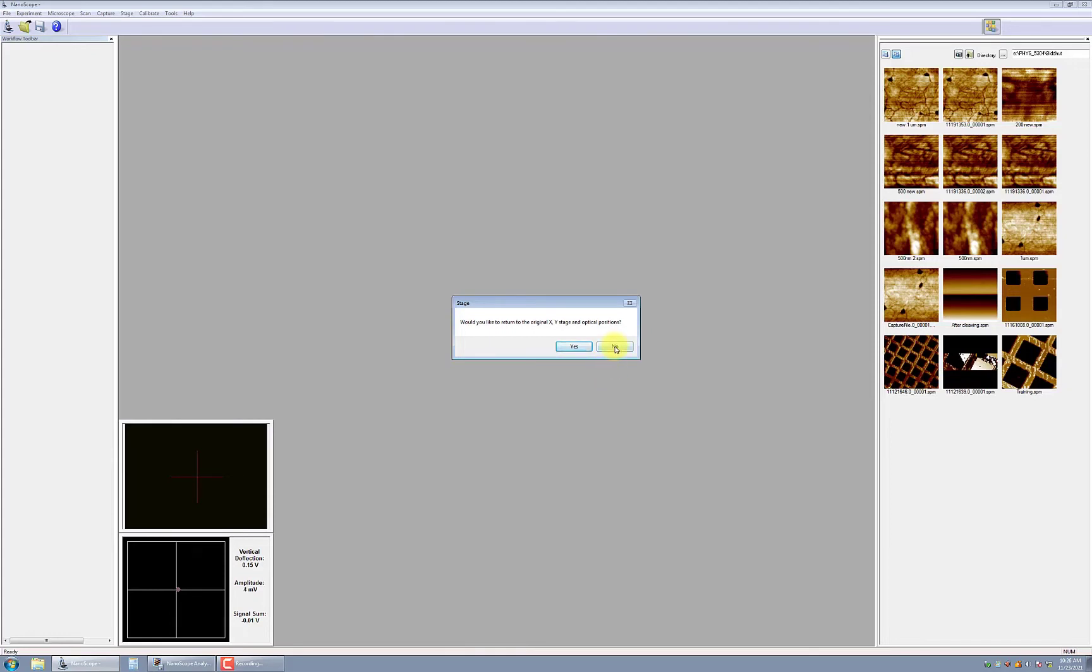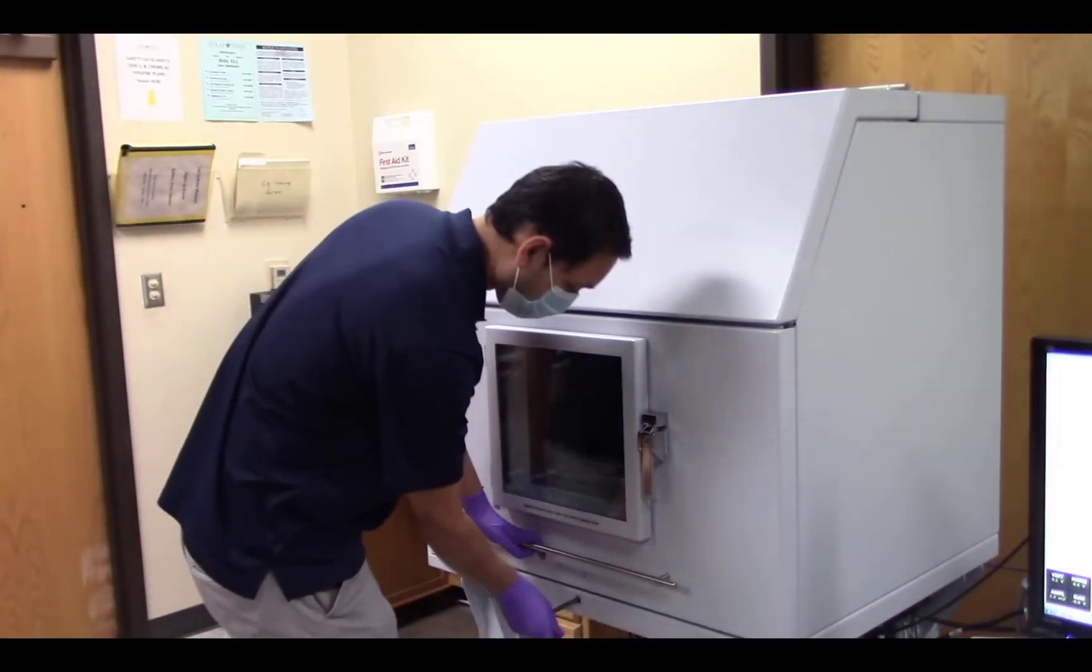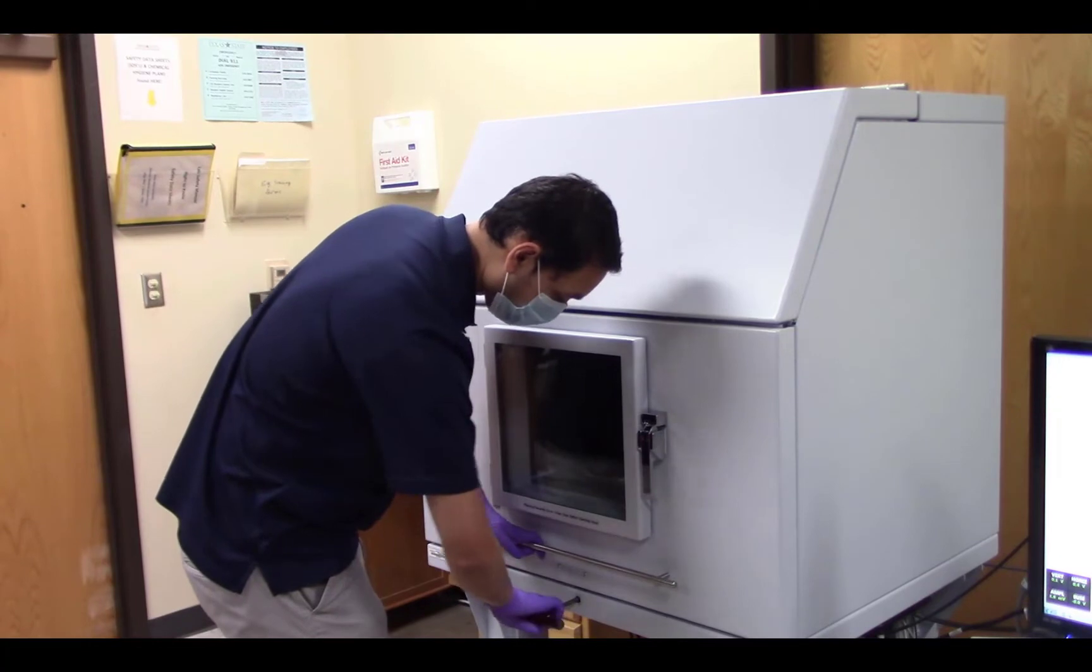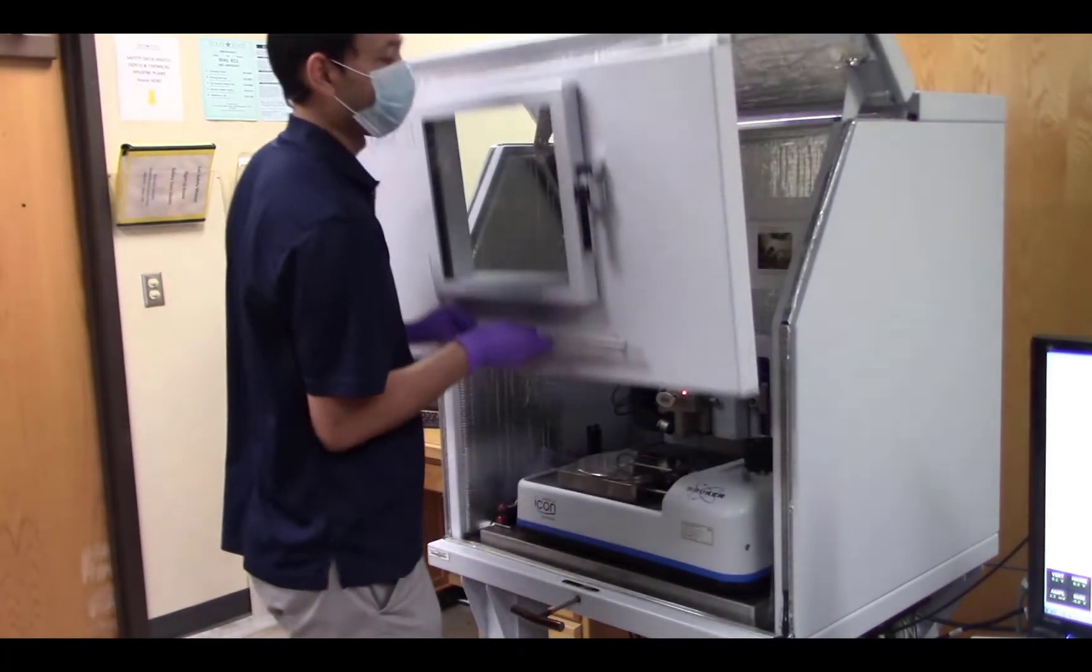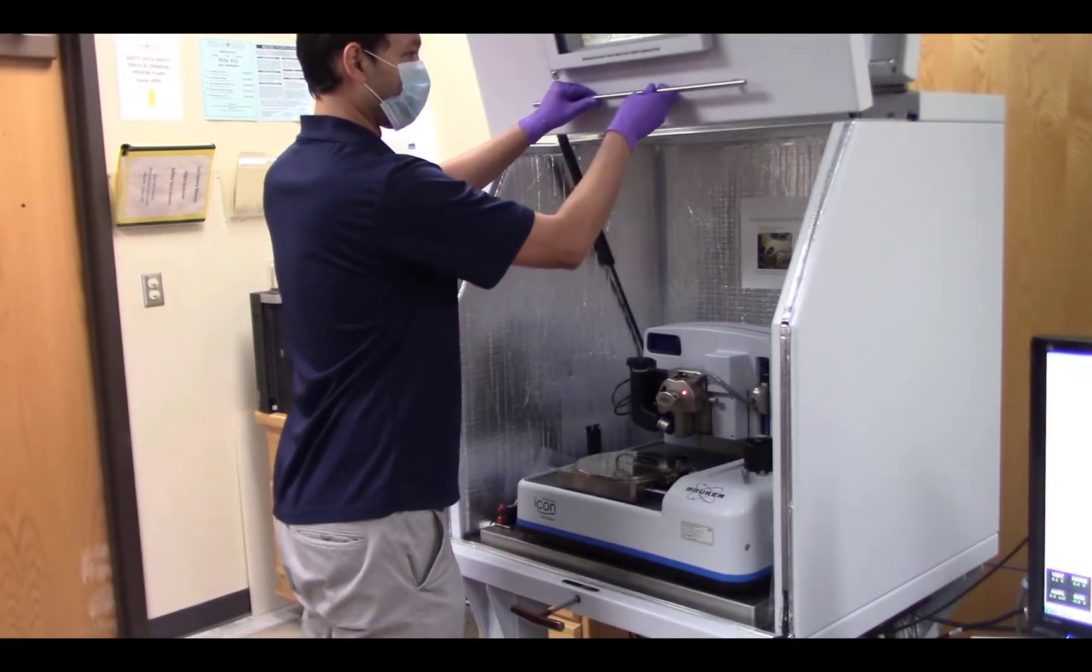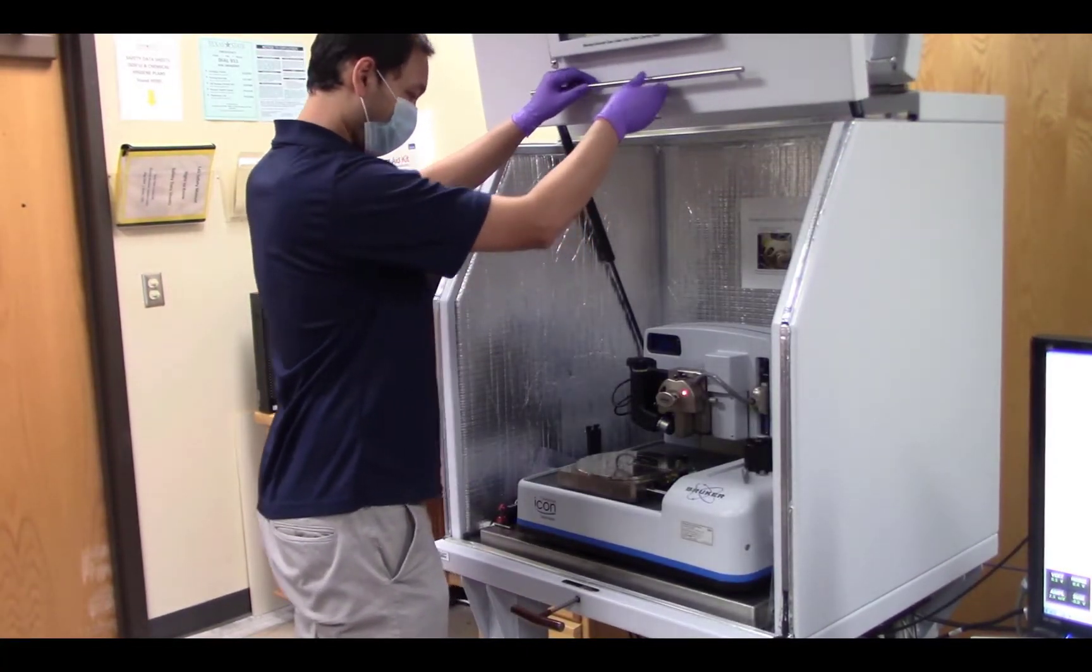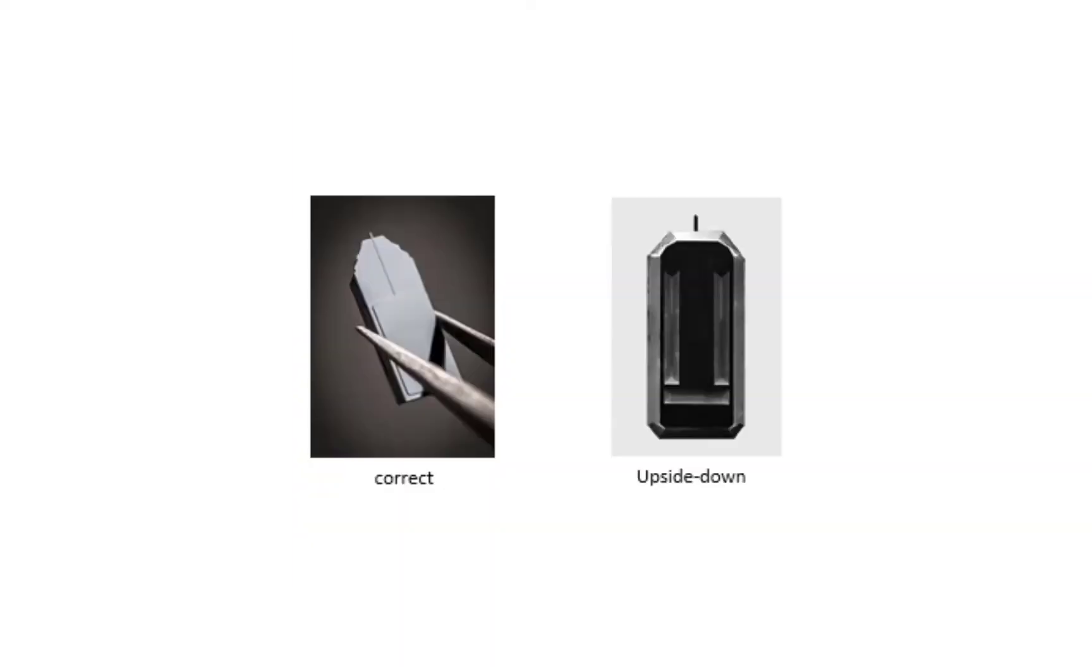Since this tool is used by multiple users throughout the university, you likely don't want to return to the stage and optical locations of a previous user. Next, you'll need to load a probe onto the scan head. To do this, open the large AFM door and bring the probe holder base to the preparation area. When selecting a probe to use in your experiment, make sure you pick one with the tip pointing up.